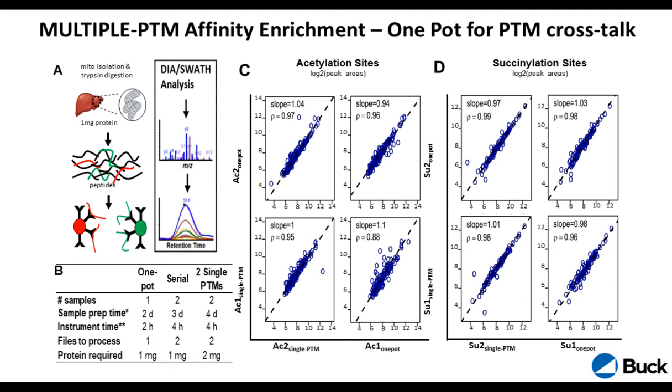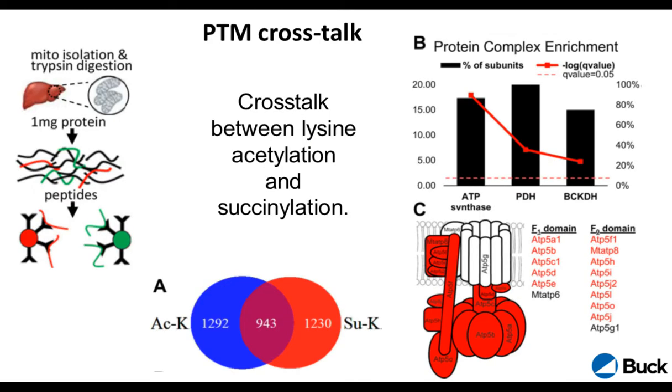And we were also testing these sequential enrichments where you take the workflow. So we did a lot of different tests and assessed not only the number of acetylation or succinylation sites that we would obtain, but also the quantitative efficiency in those. As you can see here, we had very good correlations, and we determined that the quality of data was just as good as if we did individual experiments.